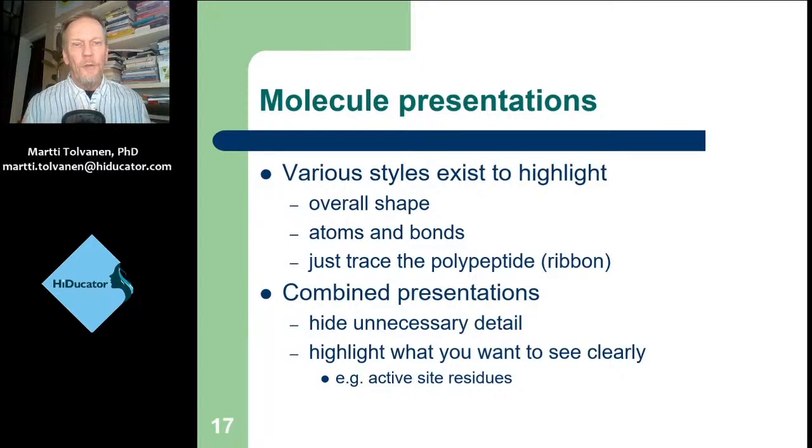We could see the UniProt numbering by taking the UniProt entry as a reference there and then looking inside the entry and comparing it to the UniProt entry was one way of confirming that we actually had the same numbering. But this could be done even inside of Chimera.